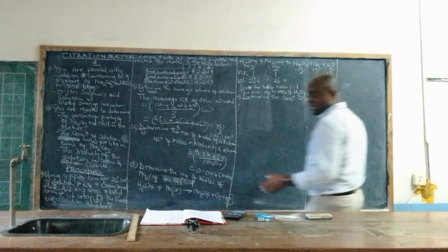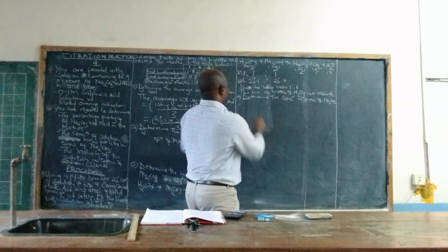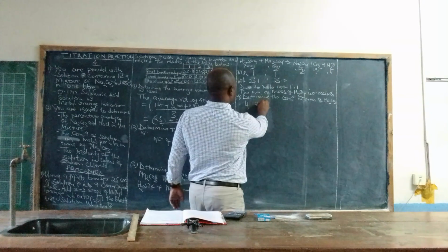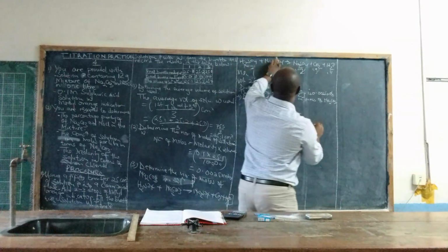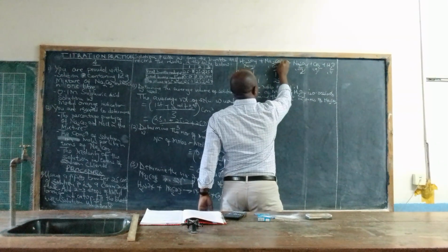So in this case, we are supposed to ask ourselves, here it's supposed to be sodium carbonate.